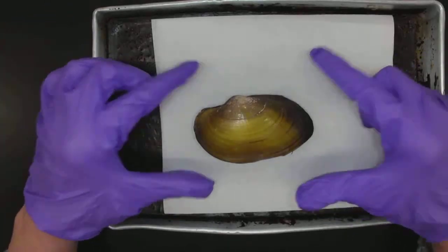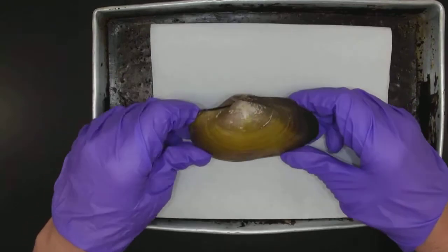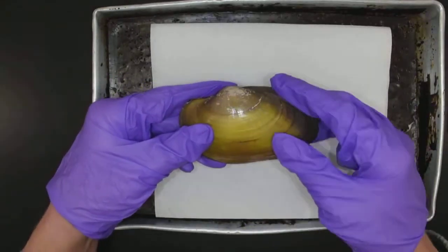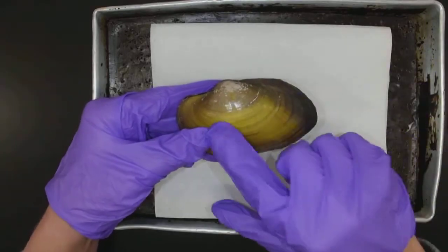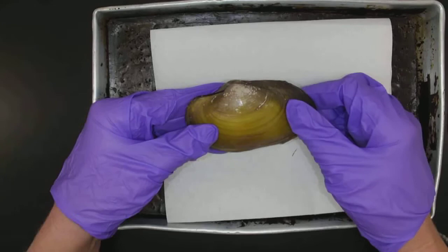Okay, here we are. Oh boy, we are looking today at a clam. Clams are amazing — they're yummy too. We're going to look at the clam. Let's look at the external anatomy first. So the most easiest thing to see about a clam shell, I think, is the umbo.